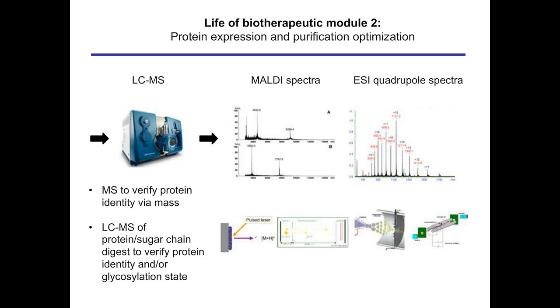In this case, it's immobilized onto a surface, and I show here in the middle bottom a peptide that's been put onto the surface of a gold slide and then hit with a laser. And typically these peptides will pick up one positive charge under the conditions, and then one simply times the amount.